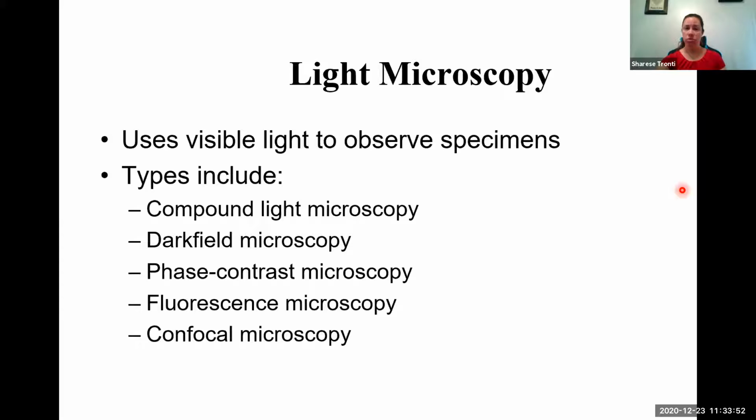But for our lecture today, we're going to focus on microscopy. There are two main types of microscopy: light and electron microscopy. We're going to talk very, very briefly about electron microscopy. We're not going to be doing electron microscopy in our teaching lab, in our class, but I do want you to be aware, so we'll touch on that.